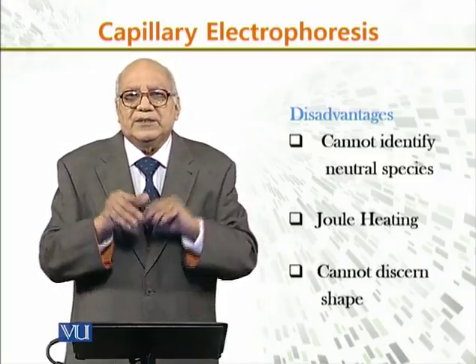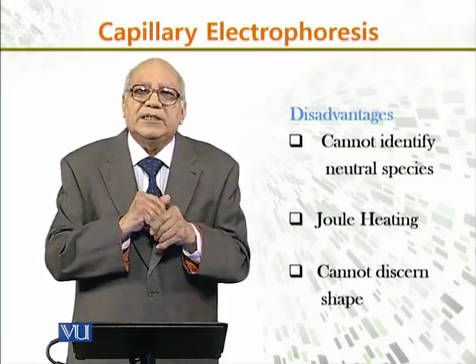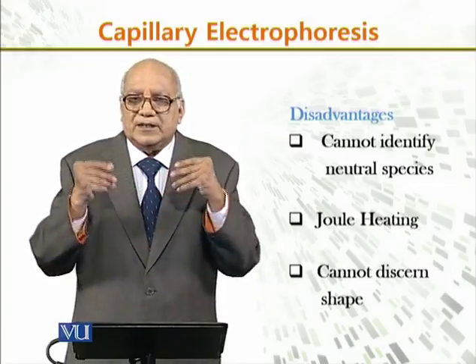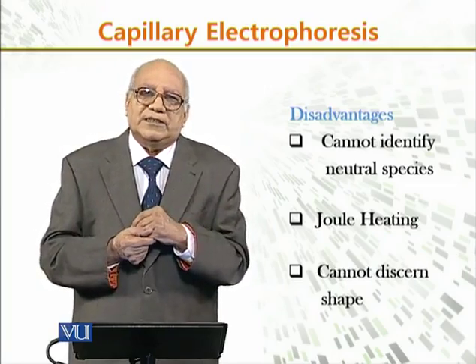So we have seen that capillary electrophoresis, as we compare it with HPLC, is very fast and inexpensive, but also has some disadvantages.